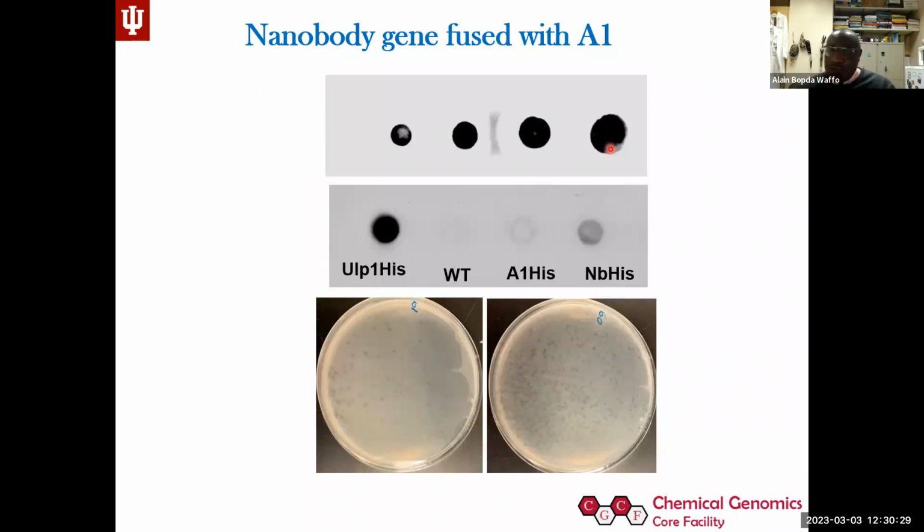We were interested more in, can we have that size displayed? Yes. Can we have the nanobody binding the lysozyme? Yes, we can really see the binding when we have the phage on the plate, have ELISA with the lysozyme and antibody against lysozyme by ELISA. And the plaques, for those who are not familiar, we count phage with the plaque assay. We make serial dilutions, and then we can tell where we can count. So this is one example.